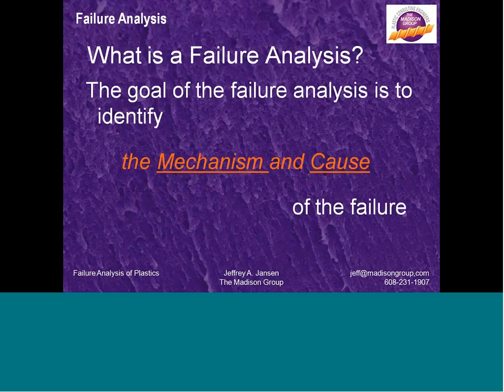The goal of the failure analysis then is to discern the mechanism and the cause of the failure. Essentially, the mechanism is how and the cause is why. How and why did this part fail?